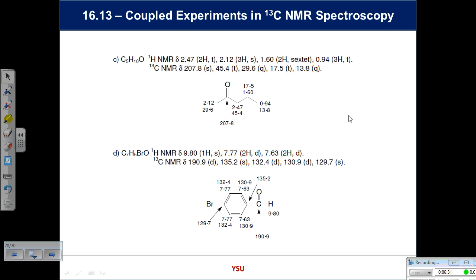Probably not, because benzene rings require 6 carbons, especially if you have the mass spectrum to check against. Maybe your mass suggests that it isn't C5H10O, maybe it's C10H20O2. That's something you can do very quickly just by calculating in your head what the atoms should add up to and then comparing it with the mass spec, and that gives you a good starting point. So in this example, it does actually correspond to C5H10O, and then you're given what I call the linear data.